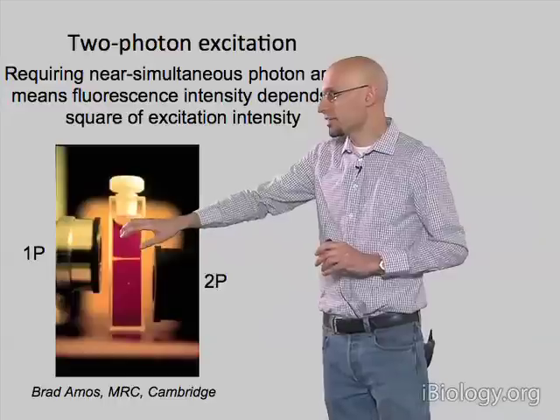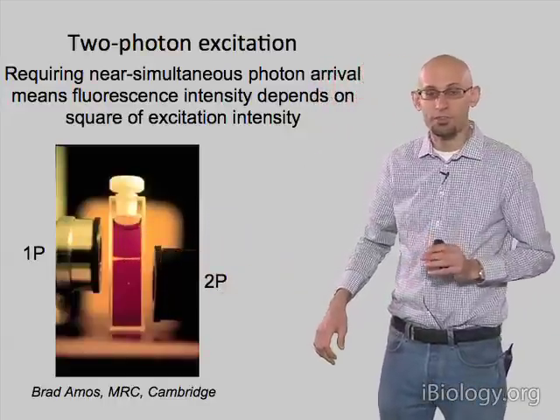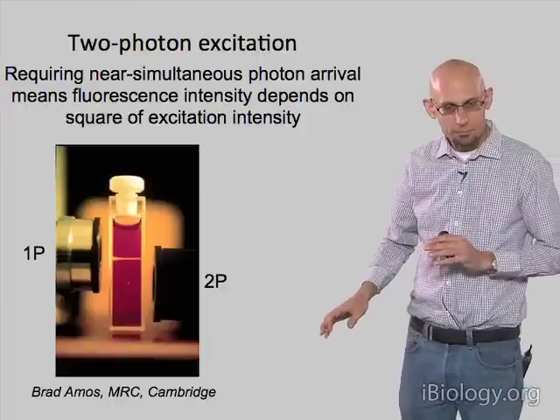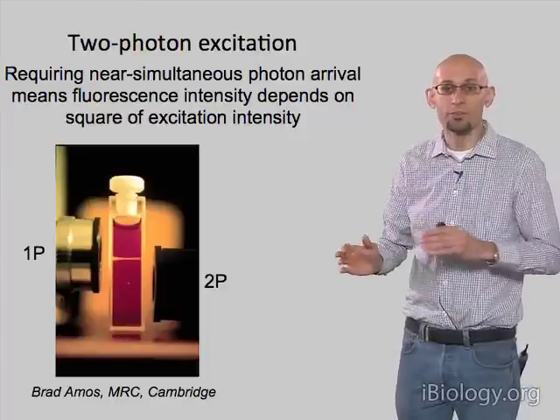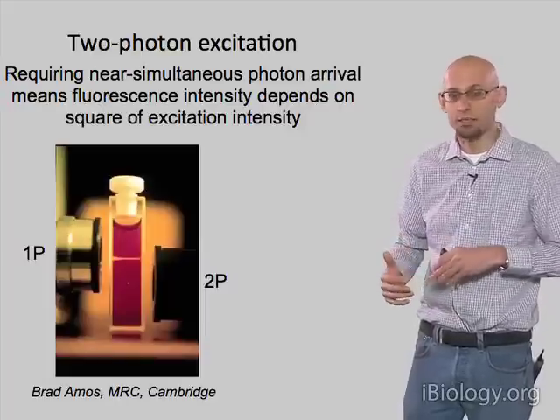And you can see there that this light is absorbed throughout the entire path that the laser beam travels through the sample, because everywhere there's light, there's going to be absorption. The amount of absorption is linearly proportional to the intensity of the light.